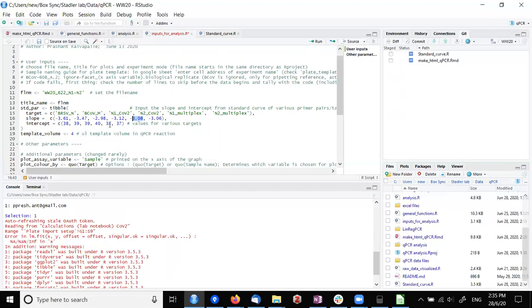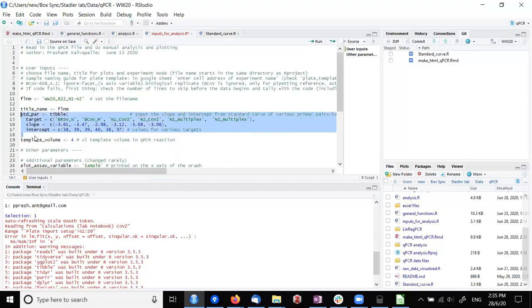Are these values reported in your big data dump, if you have one at the end of this? No, these values are not going to the data dump, but that's a good point. I think I can write below each file all of the information that goes into it. Yeah, that's quite doable, I think, but it will take some time to set it up.